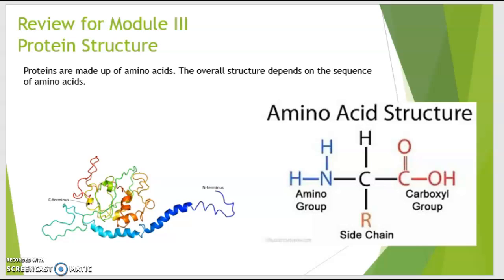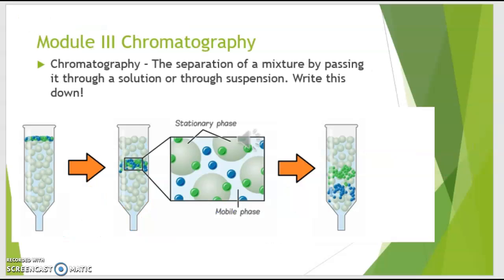Just so you know, in the lab, what we would actually do is pour your liquid that has your busted up E. coli inside of it and all the proteins inside. You would see that GFP is a fairly large protein, so it's able to move through this column chromatography fairly quickly. The blue is representing the GFP, the green fluorescent protein.